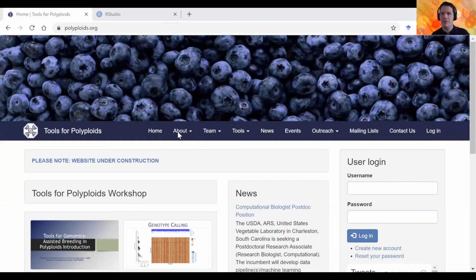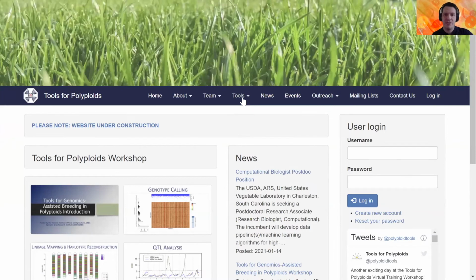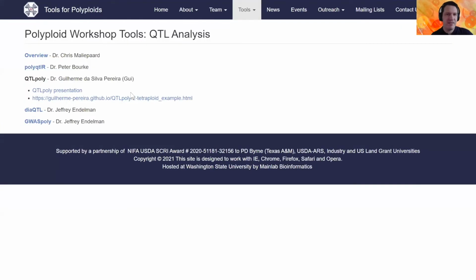So what we are going to do is go to the polyploids.org webpage under tools and workshop QTL analysis. And the second link is the tutorial we are going to try to run today.